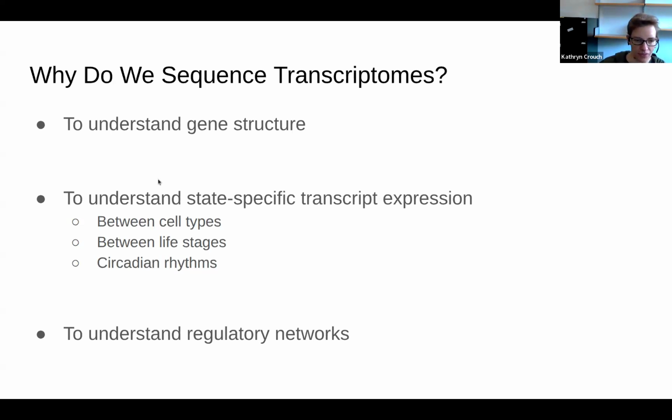The third bullet point here is basically just taking that idea a little bit further. So rather than just looking at two different samples and comparing them directly, it's more about looking at what genes change together over a broader scope of conditions, if you like. And that can help you to understand, for example, which genes might be regulated by the same promoter or part of the same promoter cascade, transcription factor cascade.